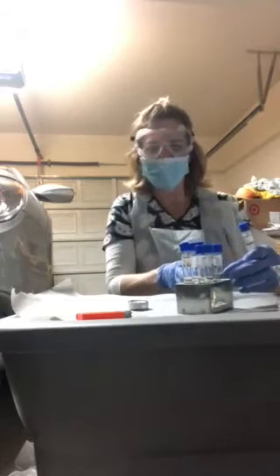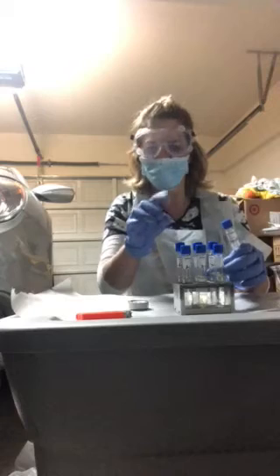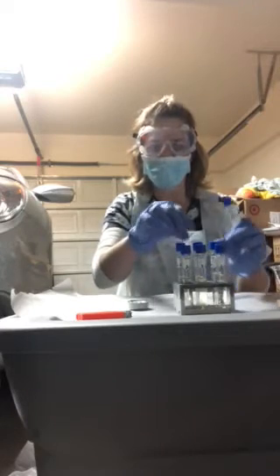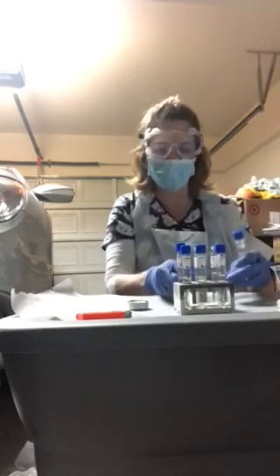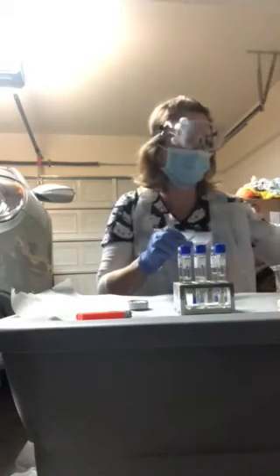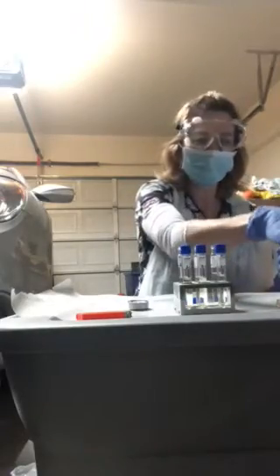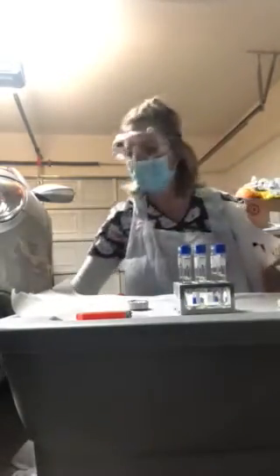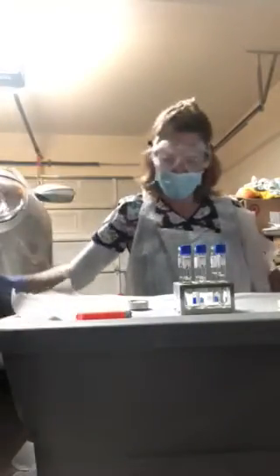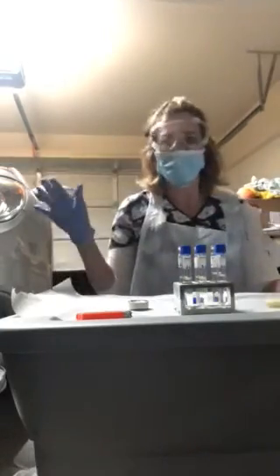I've got my three S. epidermidis at one, two, seven, and fifteen percent, and my S. cerevisiae at one, seven, and fifteen percent. I've got my alcohol and my bucket of bleach, and I've got my S. epidermidis and my S. cerevisiae.